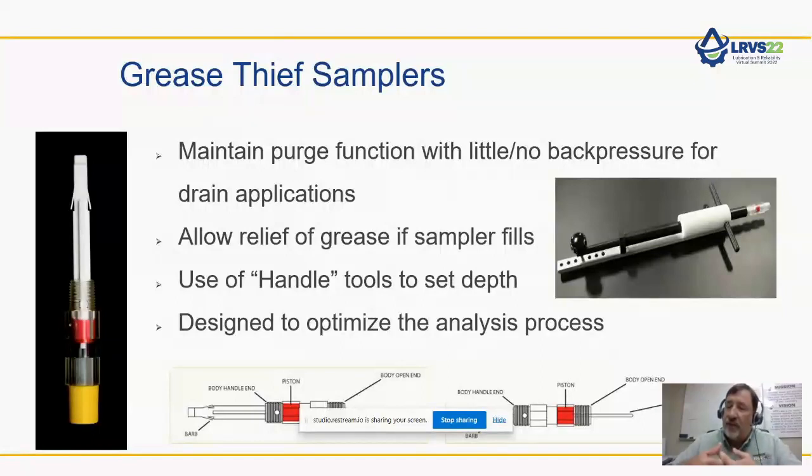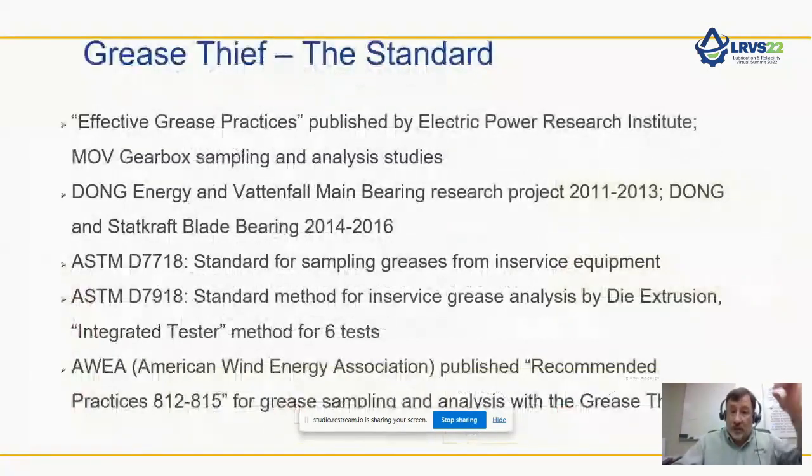A lot of folks think that, well, suction works really well for oil, so I just need a stronger suction and I can pull out the grease. And that's not necessarily true. It can work for extremely soft and runny greases, of which there are some, but the majority of the time that is not going to be effective. So we have these tools that can core the grease. So it's really become a standard.